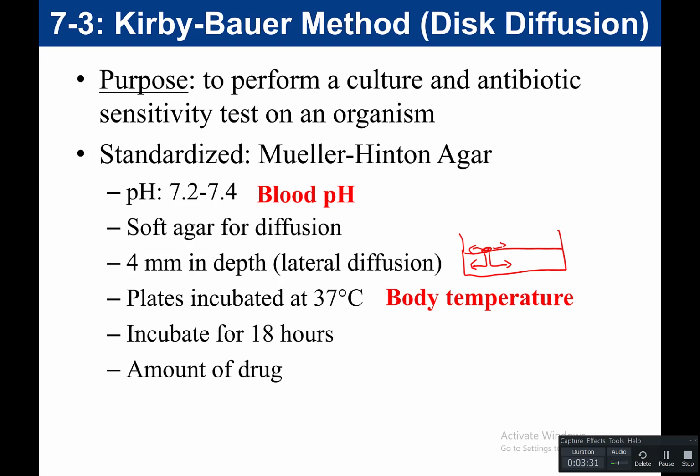We incubate our plates for only 18 hours. The purpose of that is to select for young organisms that are metabolically active and dividing, and therefore would be the ones that would respond to the antibiotic. So we do this with plates that are only incubated for 18 hours to, again, select for young organisms.